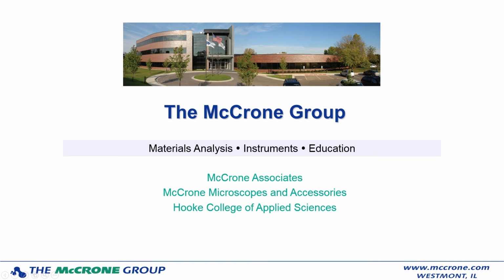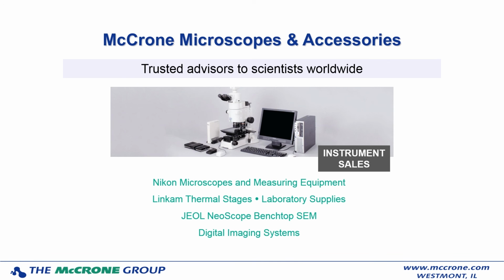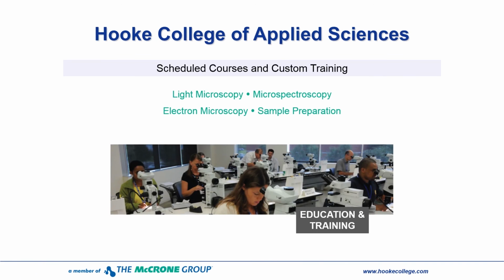Someone else has a BX51. Are there NDIC accessories available and compatible for it? Yeah, there certainly are, because I have them on mine. So those accessories are certainly available. The McCrone Microscopes and Accessories Group would sell that type of thing for that microscope, and also for the Nikon microscopes.